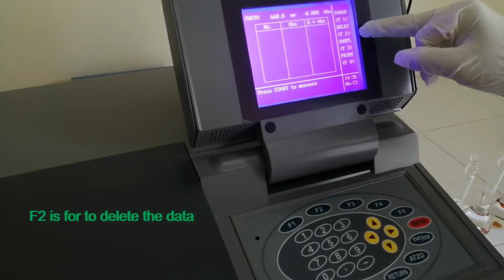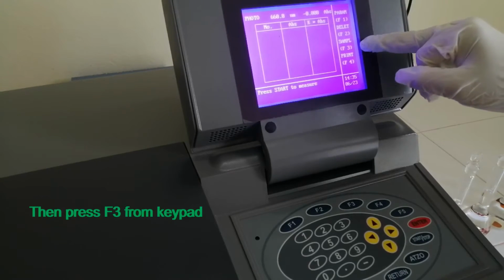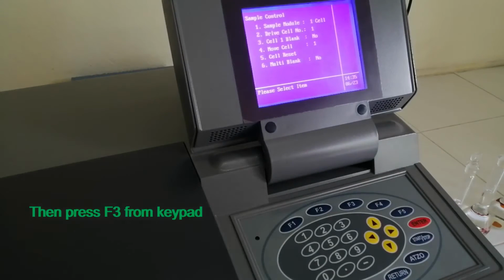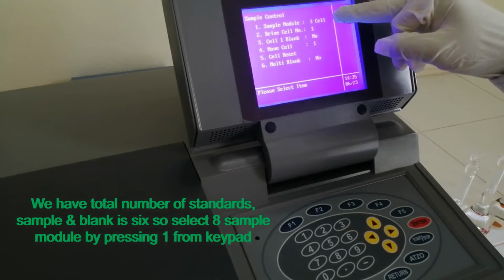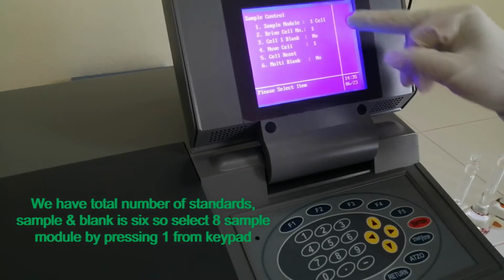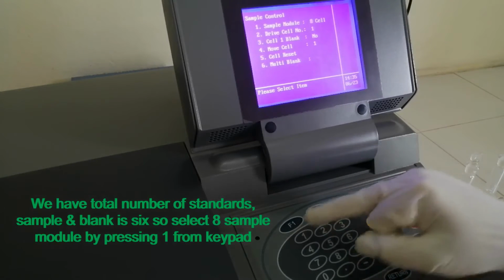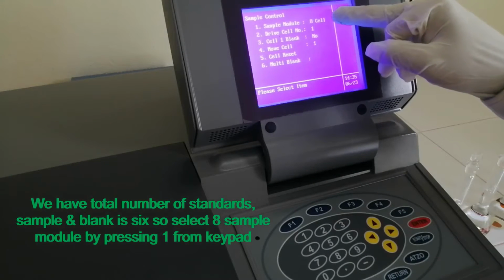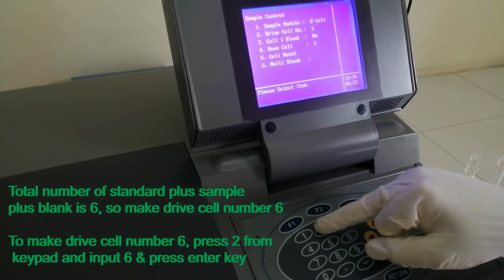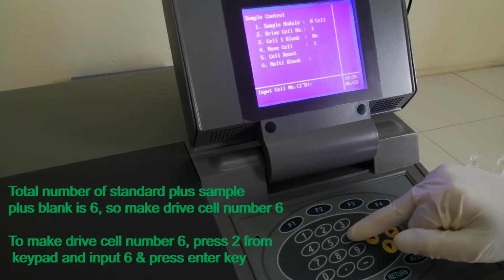F2 is for deleting the data. Then press F3 from the keypad. We have total number of standard, sample and blank as 6. So select 8 sample module by pressing 1 from the keypad. Total number of standard plus sample plus blank is 6, so make drive cell number 6. To make drive cell number 6, press 2 from the keypad, input 6 and press enter key.